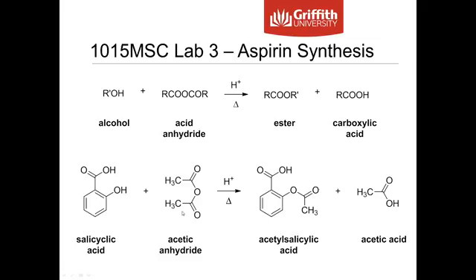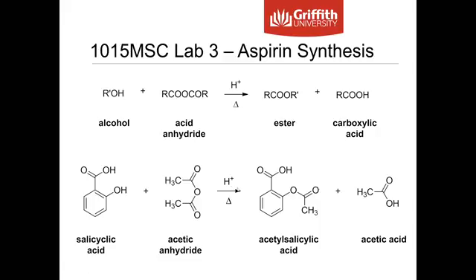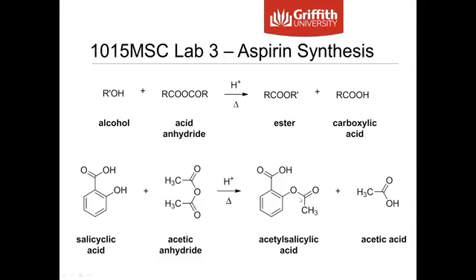It's going to react with acetic anhydride, the anhydride of acetic acid. Acetic acid has 2 carbons there, another 2 carbons, so 4 carbons in total. We're going to heat this up, use a little bit of sulfuric acid, and this will acetylate, to make an ester at this oxygen here. So we've got this R, double bond O, O, R. This is an ester functional group.